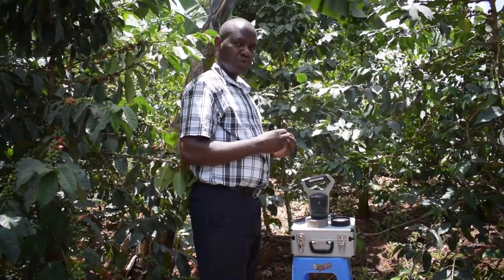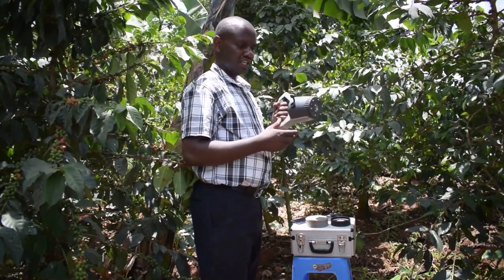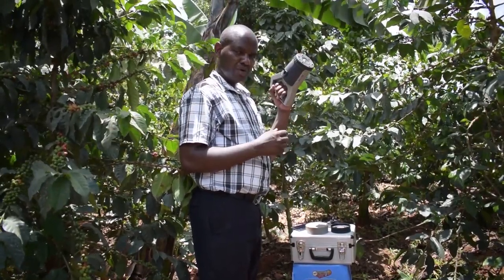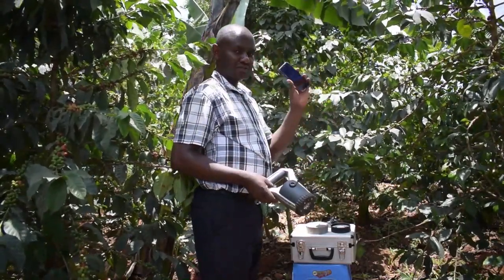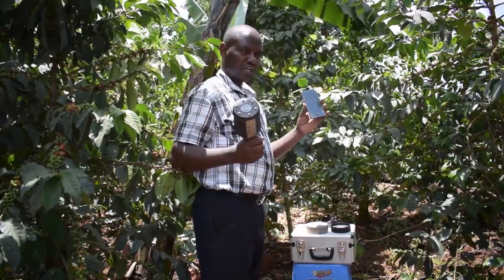We at Fathiri Africa use digital machines called soil scanners. This is a technology used to test the soil and you are able to get the results on site. This machine is rechargeable and it works hand in hand with an application on the phone, which we are going to connect the scanner to so that you can be able to test.